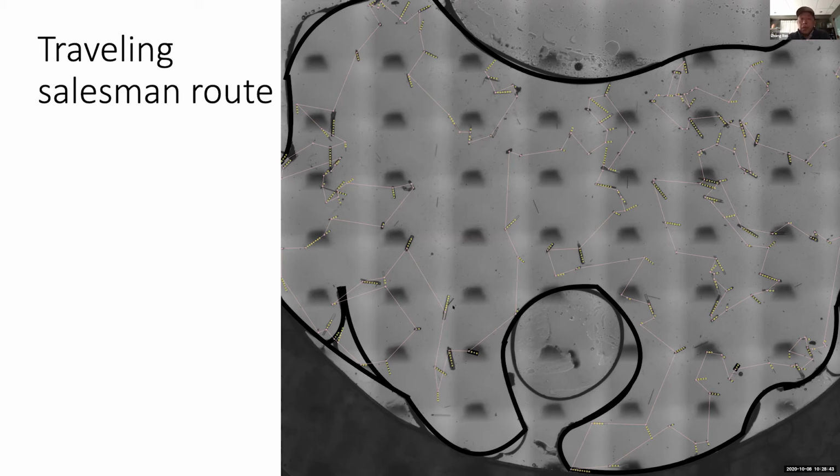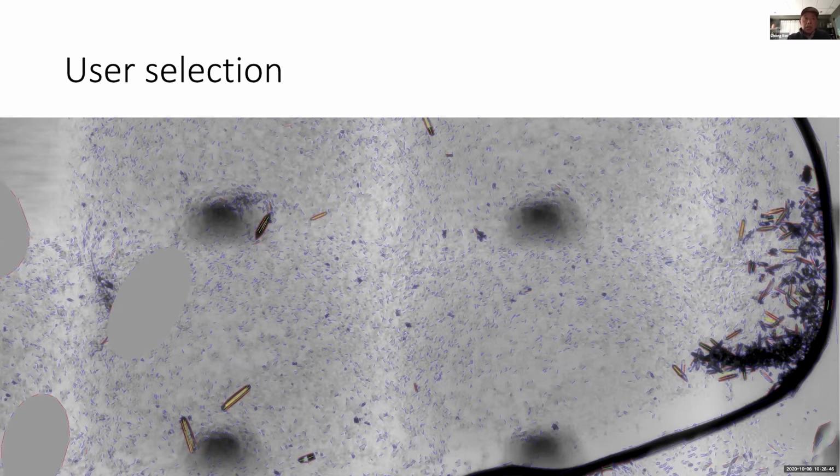There are other minor things I want to mention. Look at these crystals that are recognized. These are obviously large, good crystals, but often there are crystals that are not very large, and they are clustered together. And you may also want to shoot some of them, not all of them. But when things get even worse, there are areas that are really a disaster.